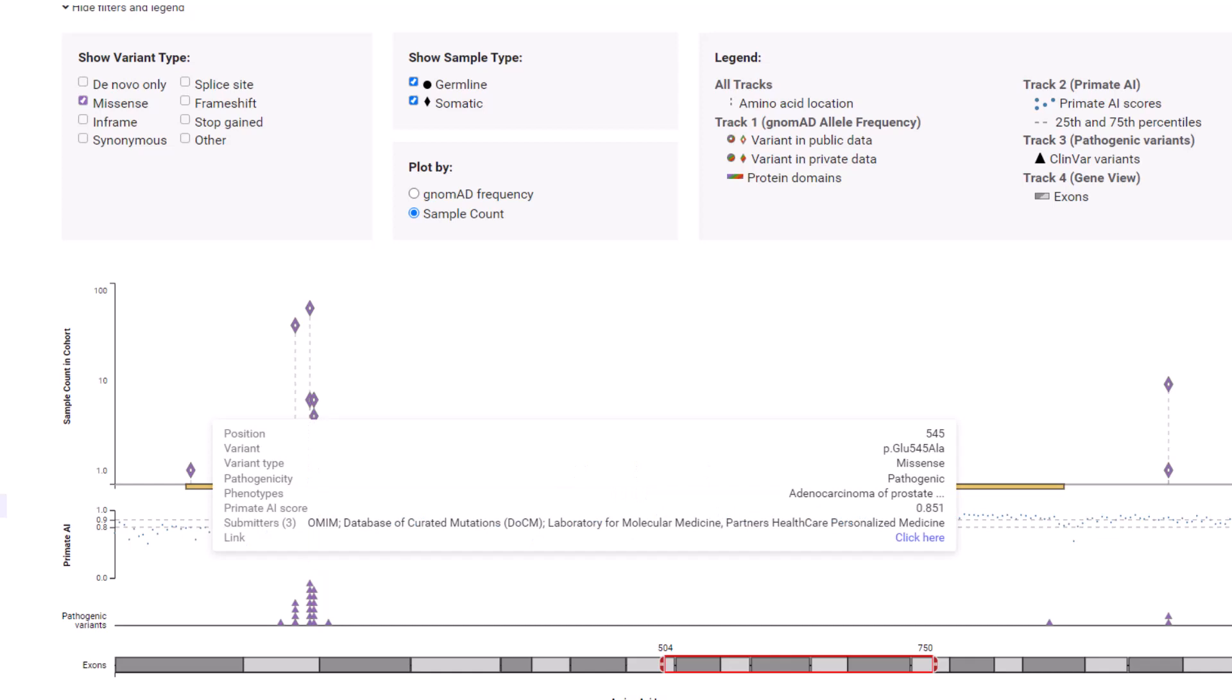Hover to view pathogenicity calls, phenotypes, submitter, and a link to the ClinVar entry.